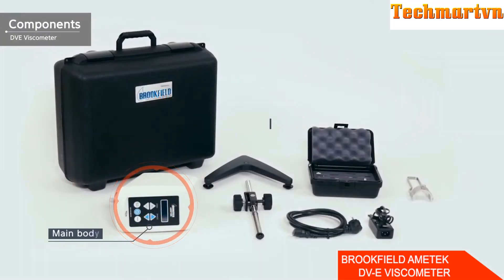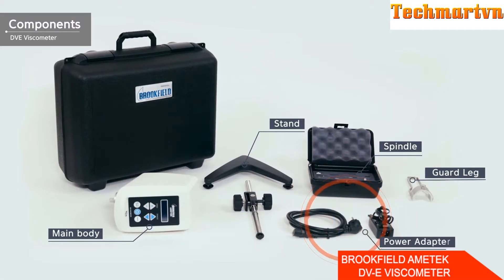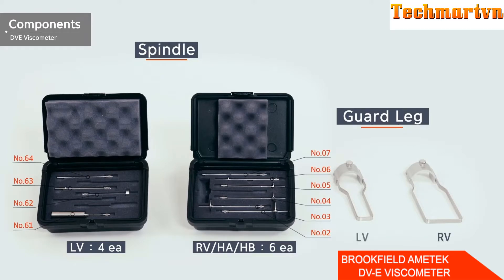The components include the main body, stand, spindle, spindle guard rack, power adapter, and carrying case. The DDE-HA and DDE-HB models do not have spindle guard racks. The DDE-LV has four basic spindles, and the rest of the models have six spindles. The guard racks on the DDE-LV and DDE-RV are different shapes and are incompatible with each other.